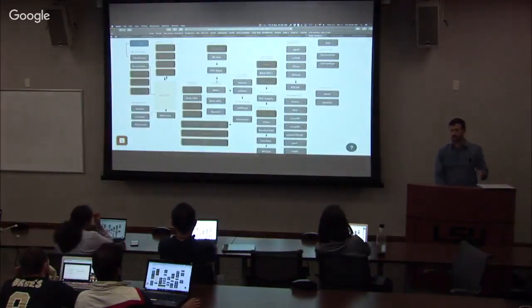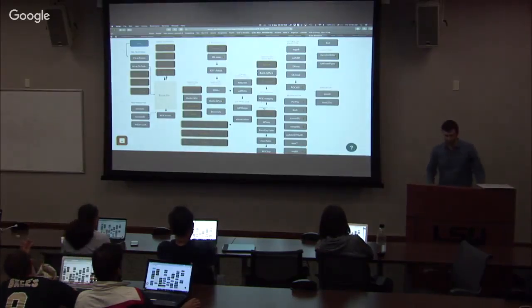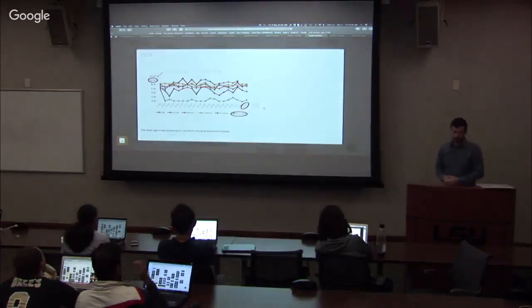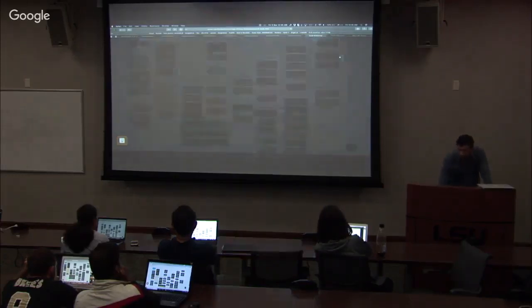And then after that, we said that we will do expression levels. So we will quantify, and that was green, right? And so expression levels, there are several methods there. And so the question is, how do we quantify? So we'll talk about that in a second.